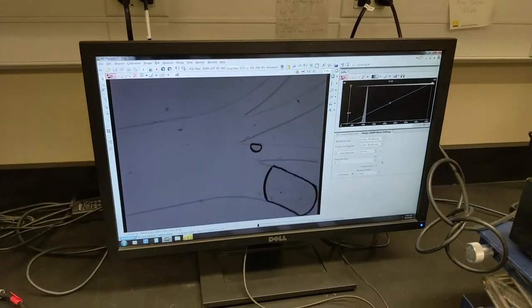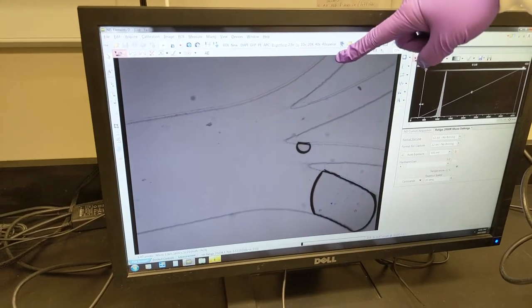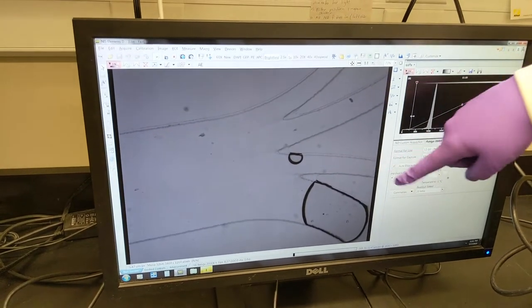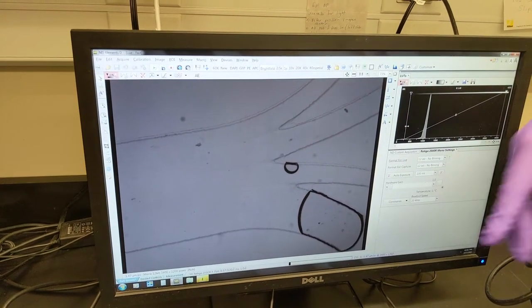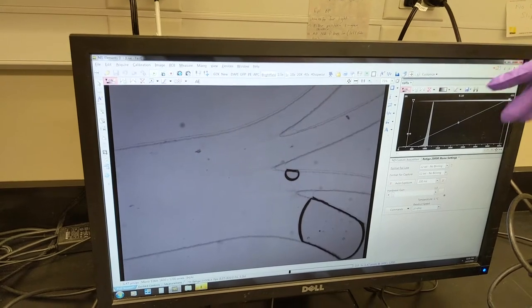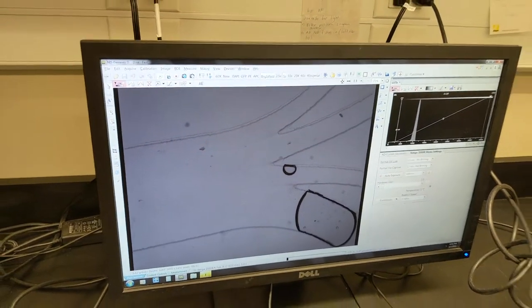So if you look at our screen, which is attached to a camera on the microscope, you'll see we have four outlets here. This top one will be where all of the white blood cells come. This will be where the cancer cells come. And this will be where the rest of the debris will come. So if we had a patient sample, in this second channel, we should get really clean, pure cancer cells that we could do all sorts of downstream work on.